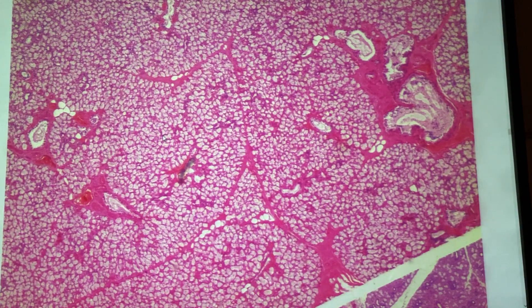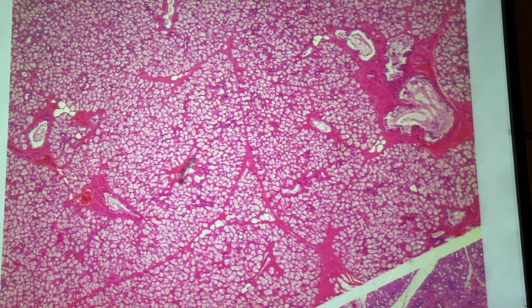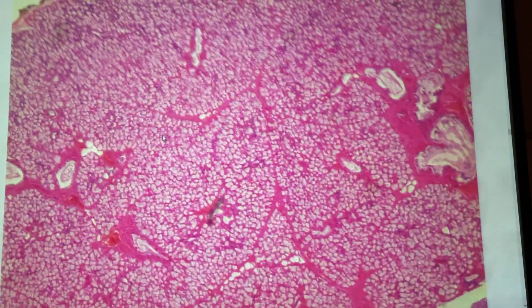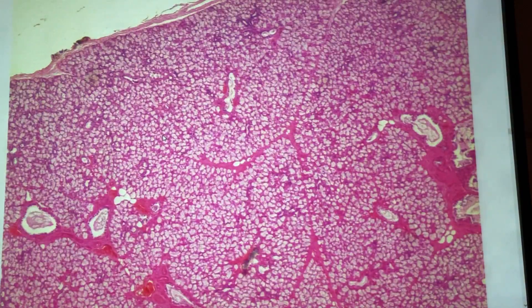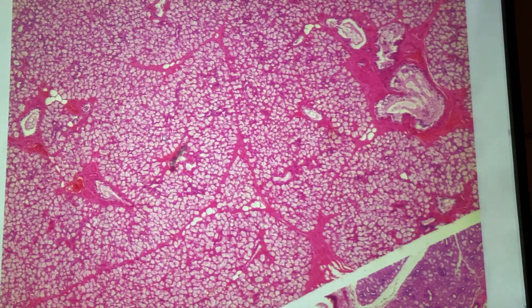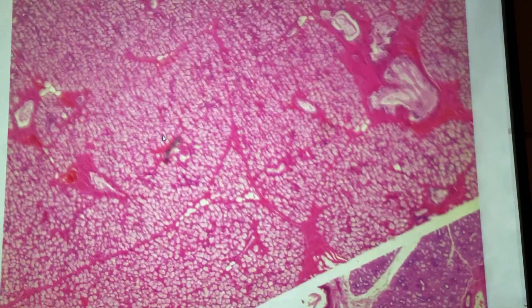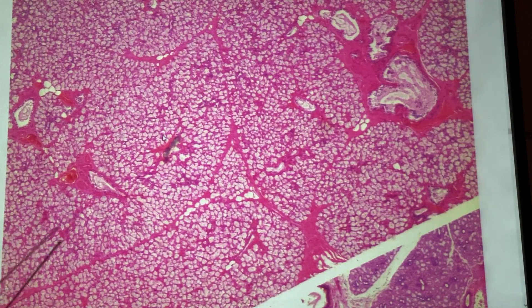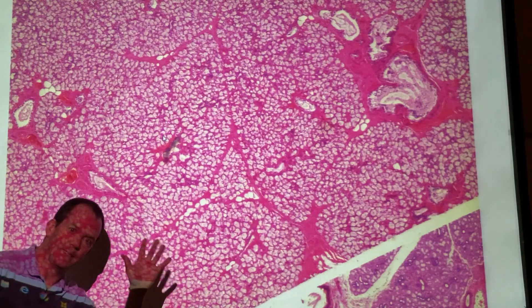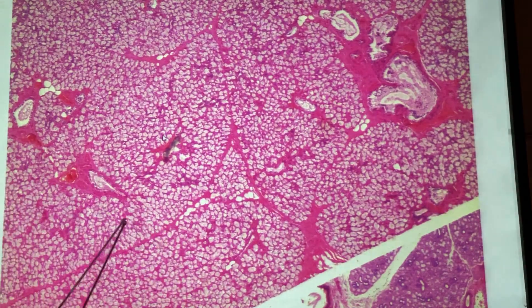All right, so we're switching gears here. This is a slide of the salivary gland. There are several different salivary glands, but you can see that there are some commonalities. Notice that there's a lot of open space here — hi, by the way — there's a lot of open space in these things.